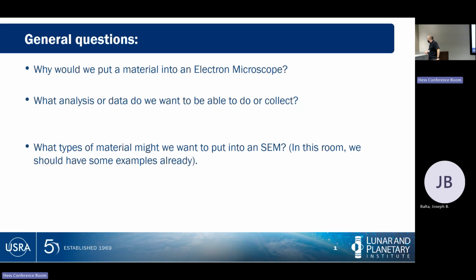Okay. So since the speaker's on here, they're working. The person I have speaking is working with tholins, which are basically kind of complex organic goop. Can I use the phrase goop and not be offended? Like, anything I say might get back to her advisor. So organic goop, and it's generated out in space by interactions with the space environment, by interactions between atmospheres and surfaces. There's probably a lot of ways to generate the stuff.